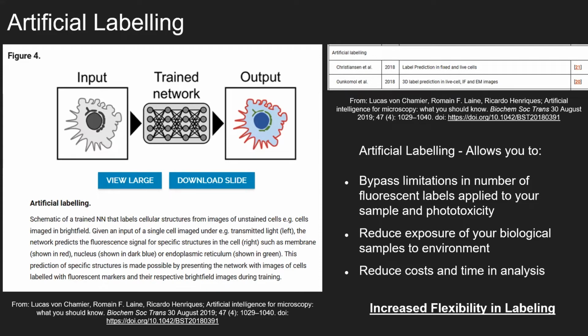But ultimately, you're going to have a limitation with regards to the signals that you can read or see. Also, there are a lot of complications figuring out the right chemistry between the different dyes or antibodies, etc. Depending on what you're doing, you're going to find that there are limitations that you can get past if you can digitally label, which you can do through machine learning, which is fantastic.